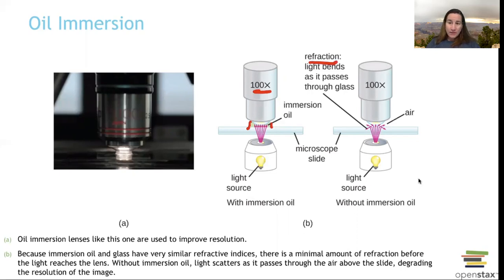So this is your light microscope on the oil immersion objective. It's 100 times for the objective lens, and then you're going to multiply it times the 10 on your ocular for your total magnification of 1000 times. If you were using scanning, you would have 4 times 10 and you'd have 40 total magnification. So this is the light microscope, how it works, total magnification and parts. I'm hoping that all of this is a repeat for you and you already know all this stuff.